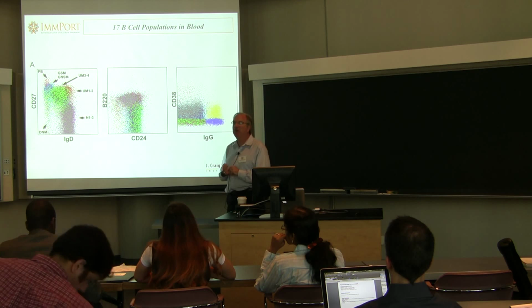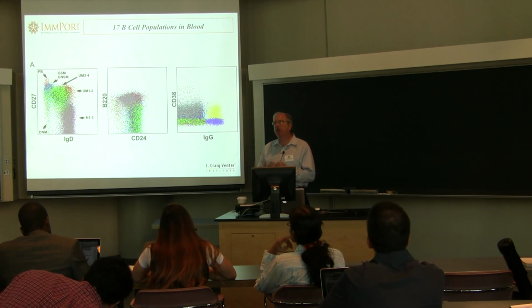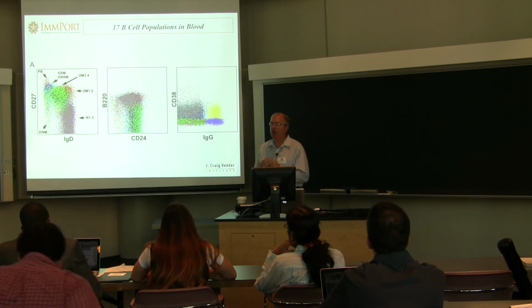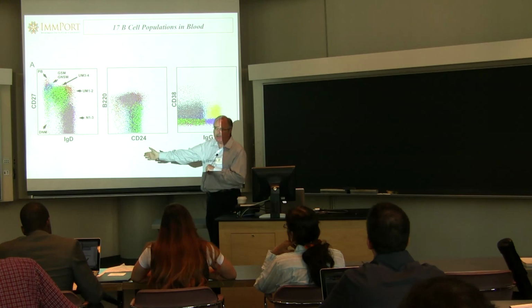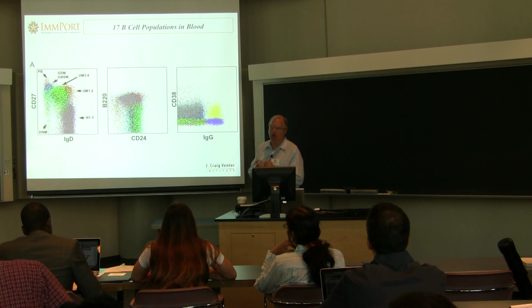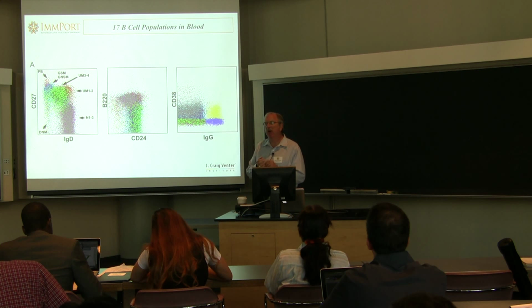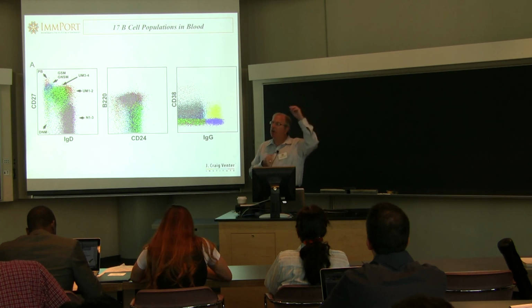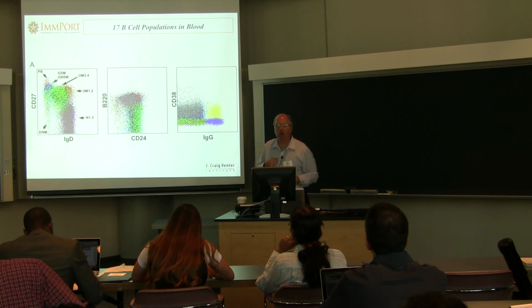Yes, that's a good question. There are 2 parameters that have to be used to configure the FLOCK algorithm. We have to decide how many partitions to make in each dimension. The example I showed, we made 10, but you could choose 20 or 30. And you have to decide what that density threshold is going to be. And those parameters will influence the results that you get. And when we're at the computer lab this afternoon, I'm going to show you some examples of what impact that has on the results that you get. That's a good question.